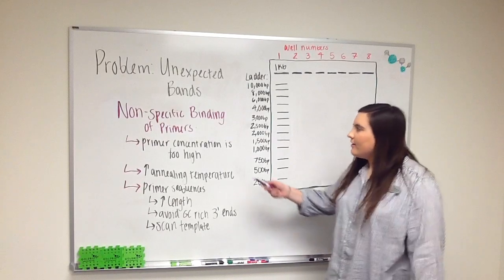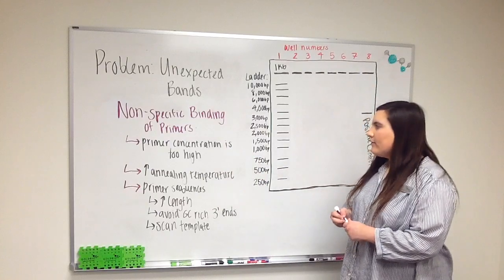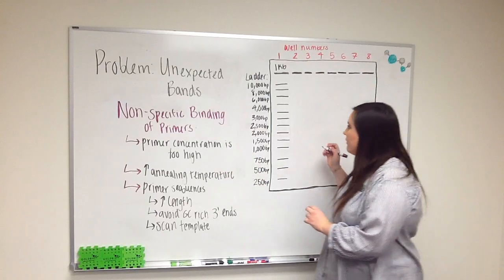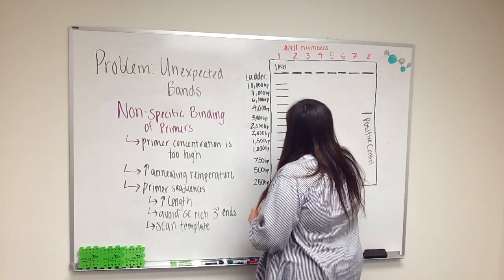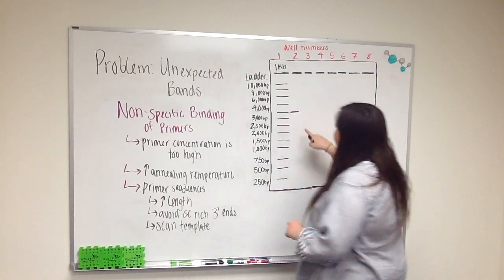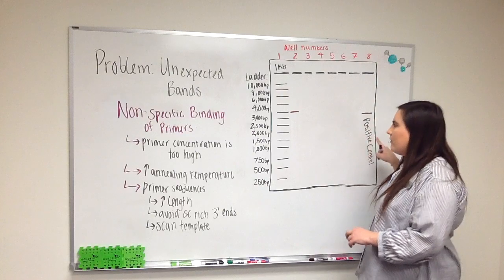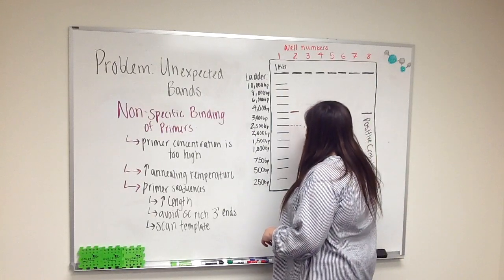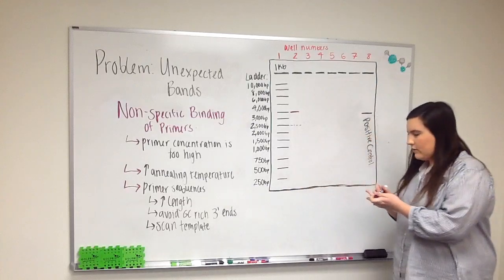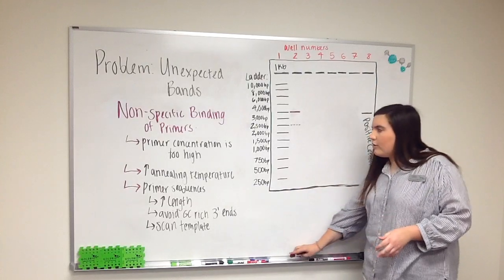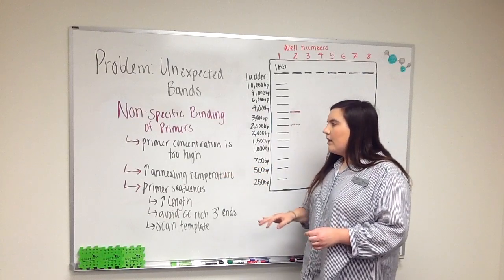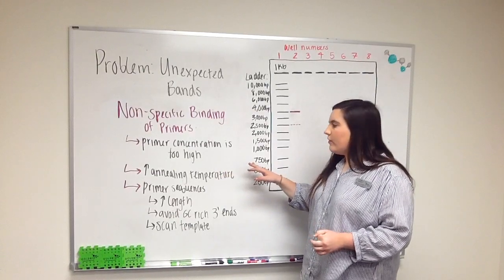The next issue we're going to be discussing is non-specific binding of primers. This could present itself as multiple things on the gels, but one way that it could present itself is that you might get your band that you expected at 4,000 base pairs, but you might also get a faint band at an alternate site. This could be because your primer concentration is too high and it's over-saturating your template. Optimize your primer concentration for the best results.